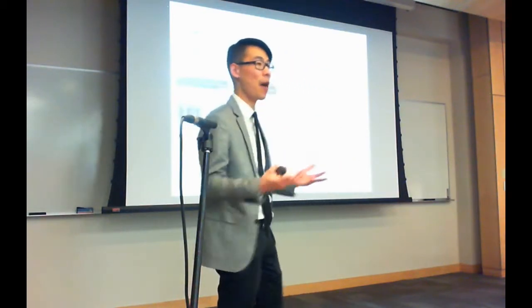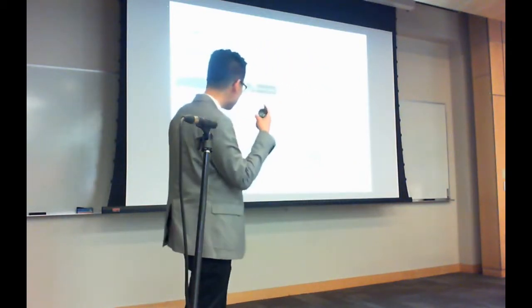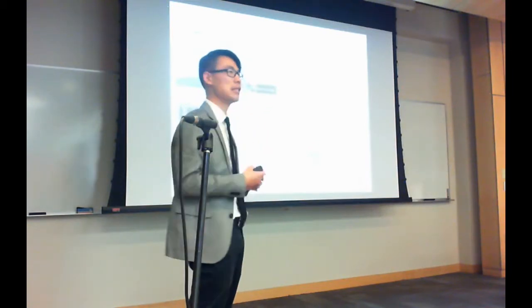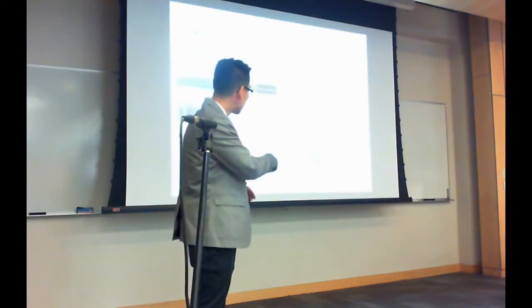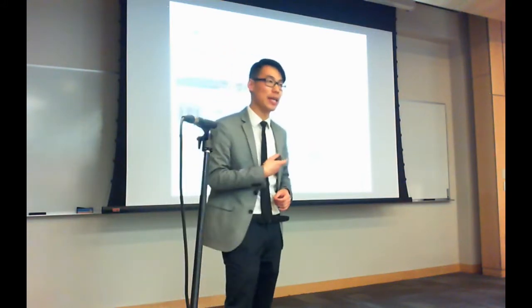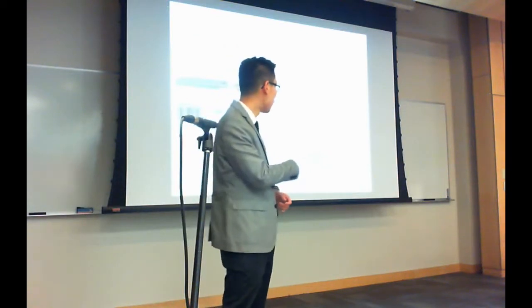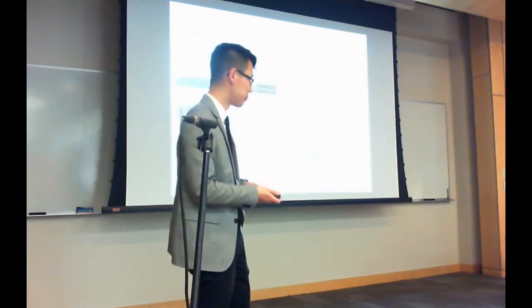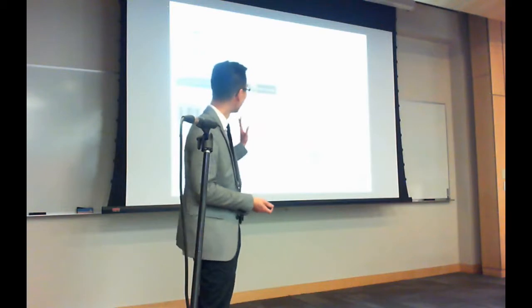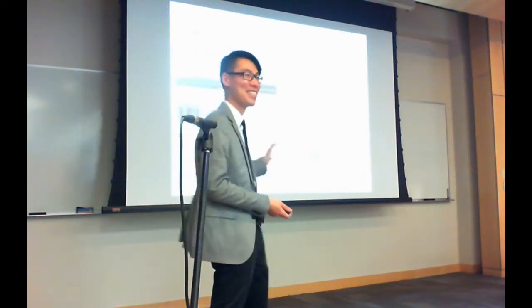And we've seen how the community has really bought in and has created a resource that's immensely useful. And we also did the same thing: we created libraries for proteomics data. And we've increased the size of the libraries by 4x and doubled the coverage of the proteome. And so I guess it doesn't seem like we did much in the past six years by putting it all on one slide, but it's been fun at least.